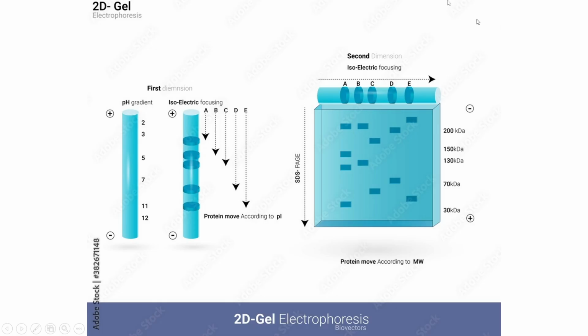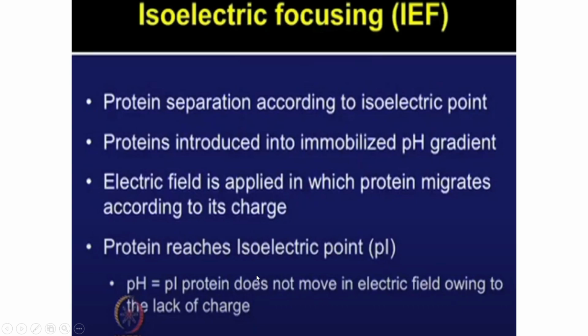So that was just an overview or gist. We'll go into detail about how exactly this is performed. There are a few steps after this in order to go ahead with SDS-PAGE. We'll talk about that and then we'll talk about SDS-PAGE too.